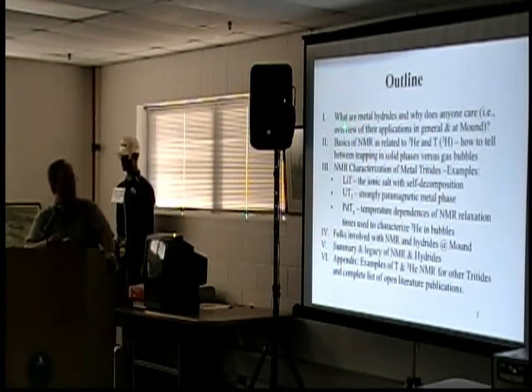At first, we're going to say, what are metal hydrides and why does anybody care about them? And basically, that's kind of an overview of what they are and a very general view of their application and what was of interest at Mound. I will then try to give in a few minutes a tutorial on NMR, specifically as it related to the helium-3 isotope and tritium, and how to tell the difference between trapping or retaining helium in the solid and in gas bubbles. That's one of the things we did a great deal with.